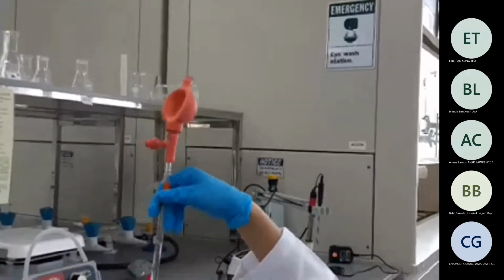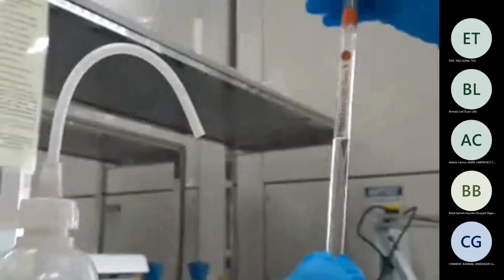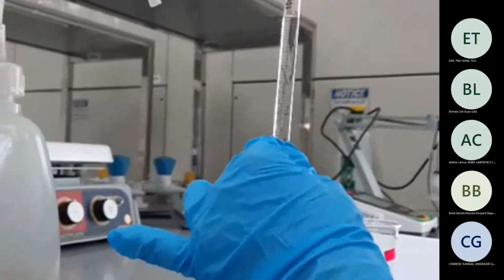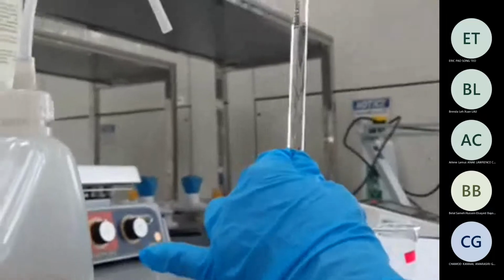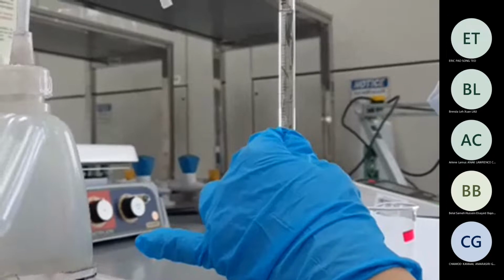I cannot see from here. A little bit more, I think. 0.05 maybe. Yeah, it's too much. Now you need to, again. Yeah, now it's okay. Straighten it. A bit more actually. Take more and then try to reduce it. That is easier. Take more. Yeah, now try to reduce it. Yeah, it's good.